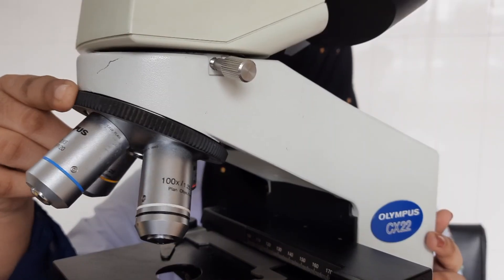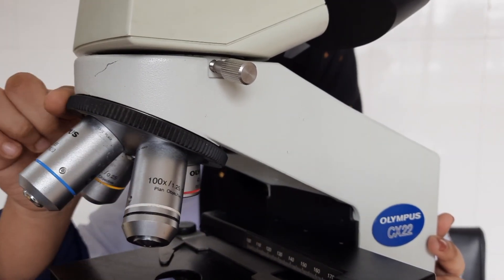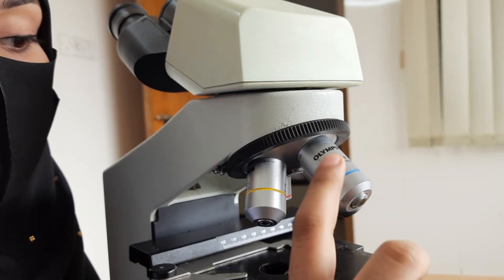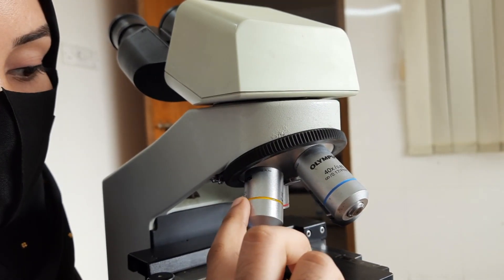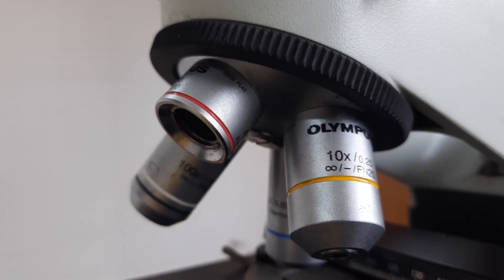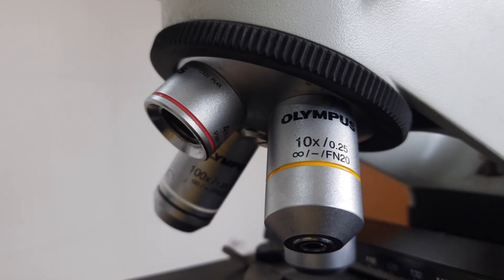You can easily switch between different objectives by turning the nose piece. The objectives are a set of lenses positioned below the head in the nose piece. Each objective lens offers different levels of magnification, typically ranging from 4x to 100x.